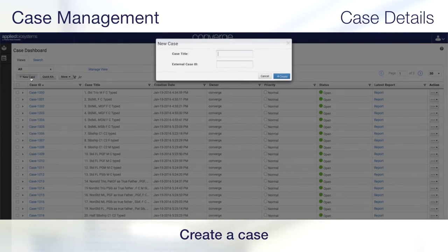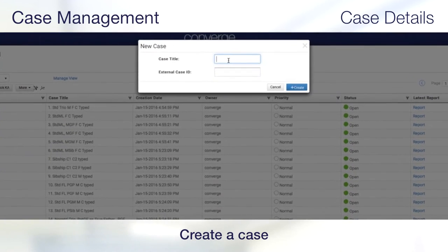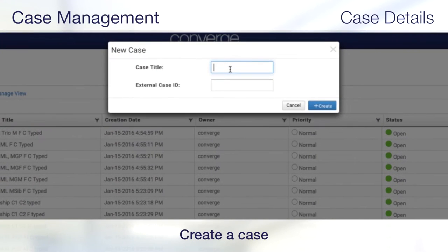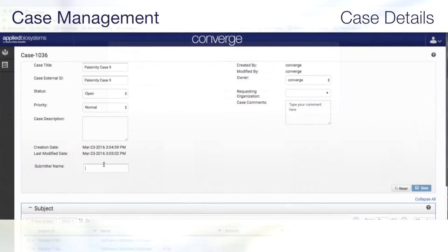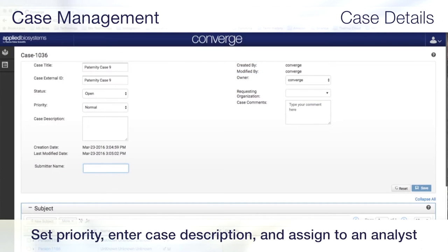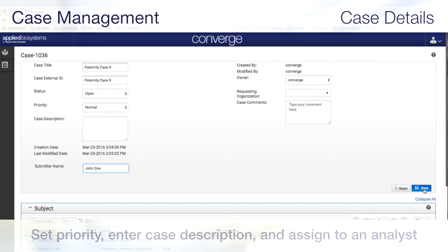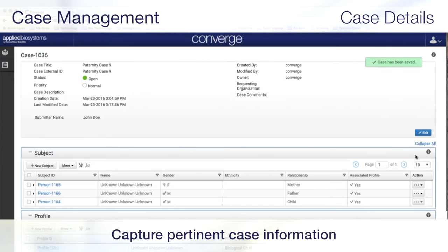Create a case by giving it a title and an ID for external system linkage and tracking. Once created, you can set priority, enter case description, assign to an analyst, and enter any case comments to capture notes or provide pertinent information to the analyst.